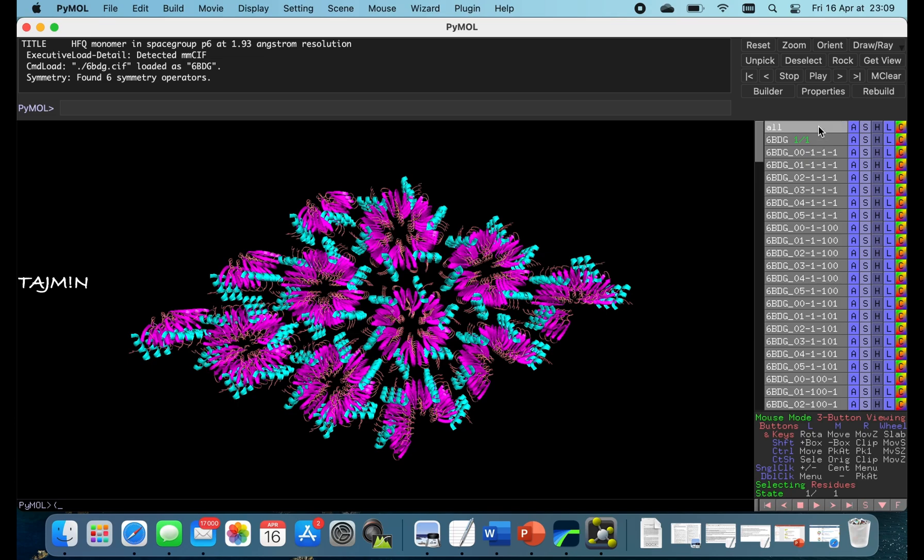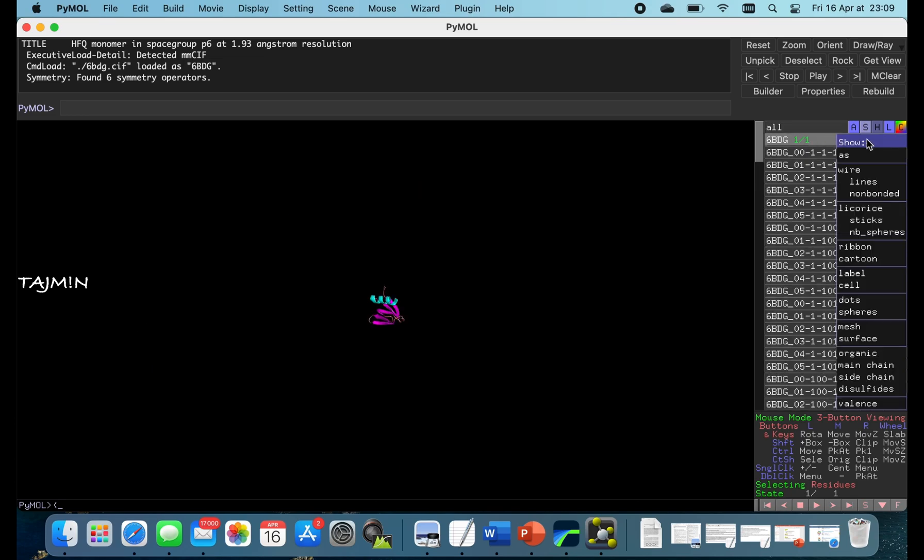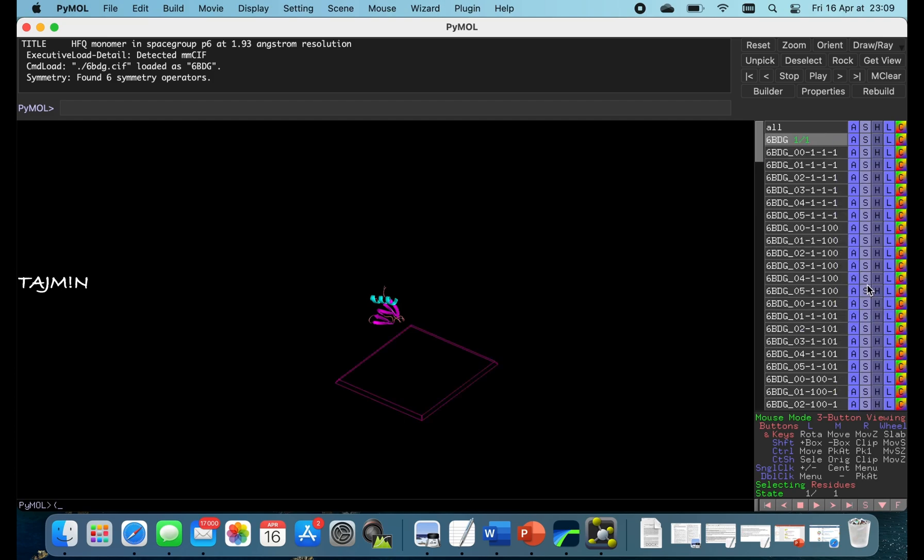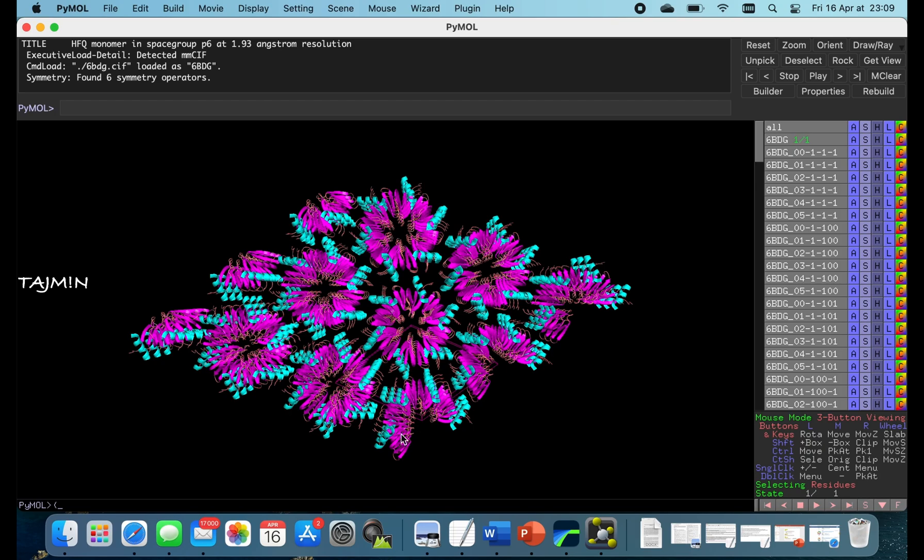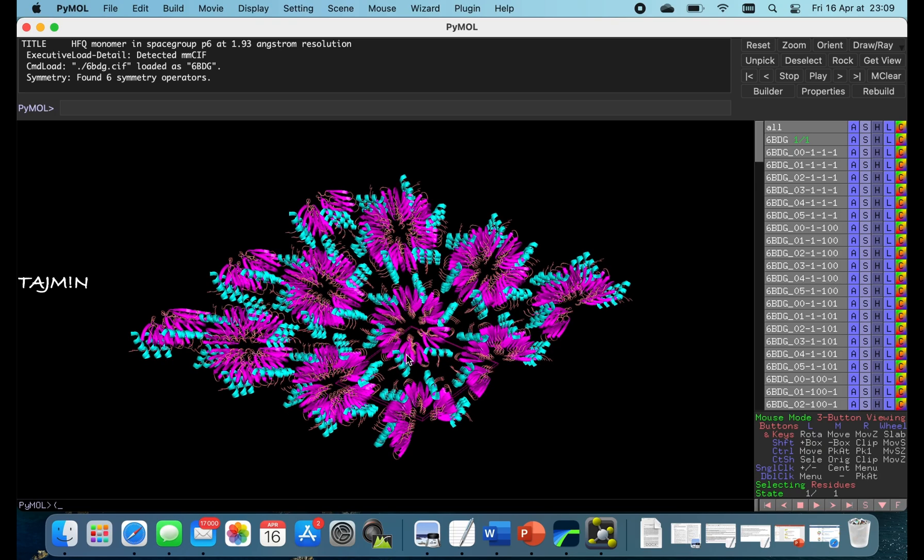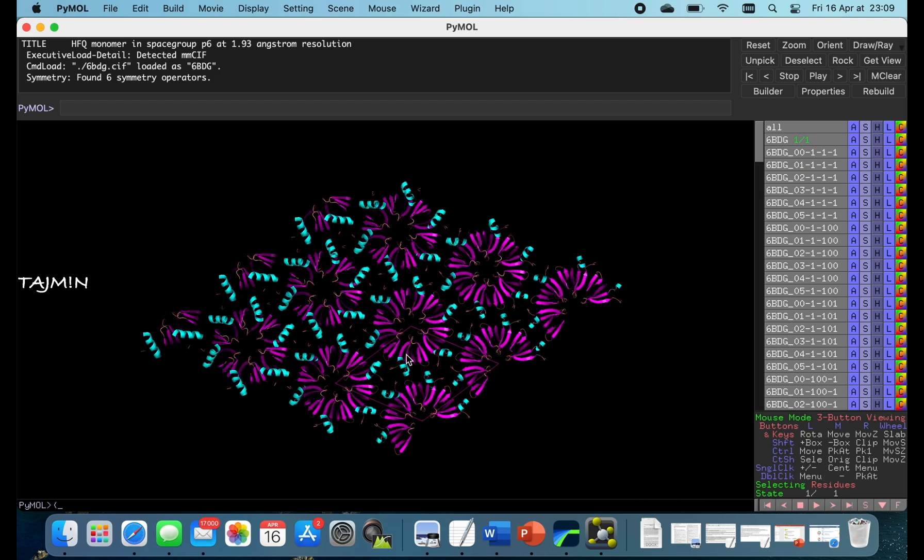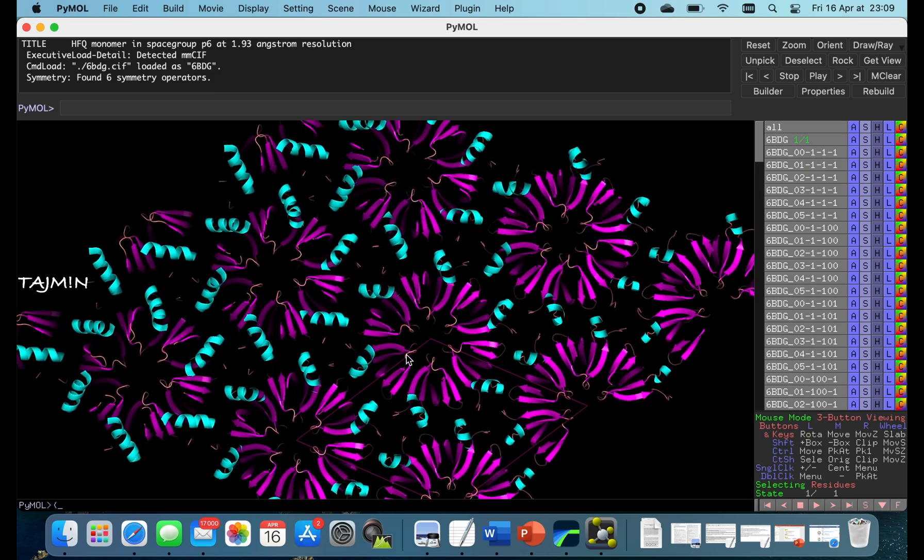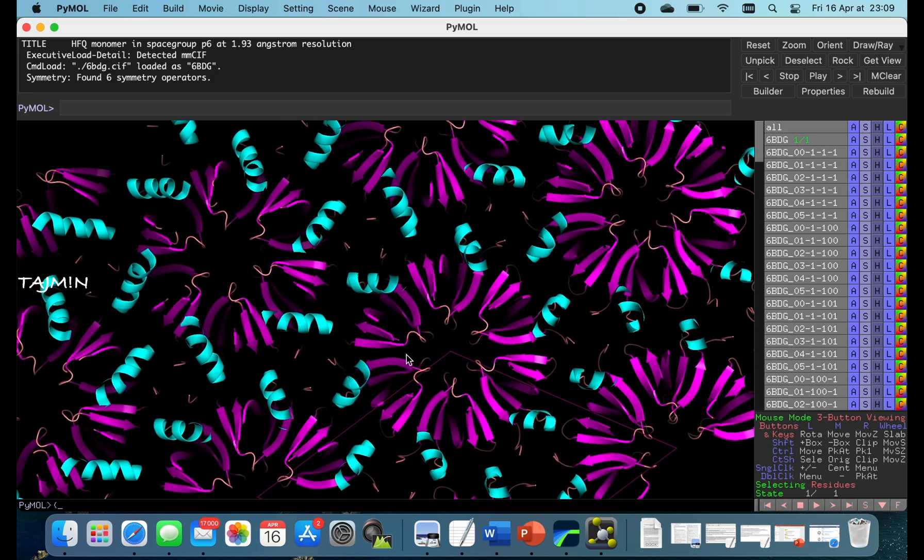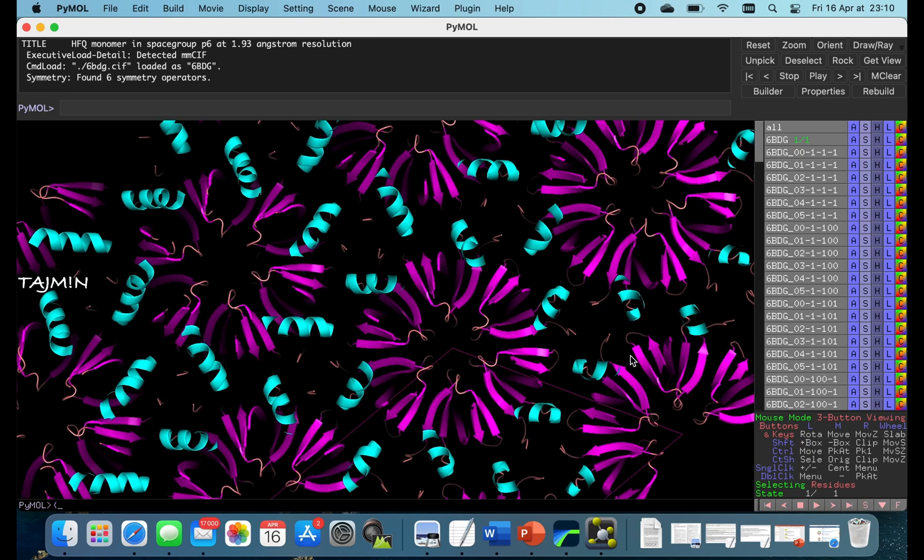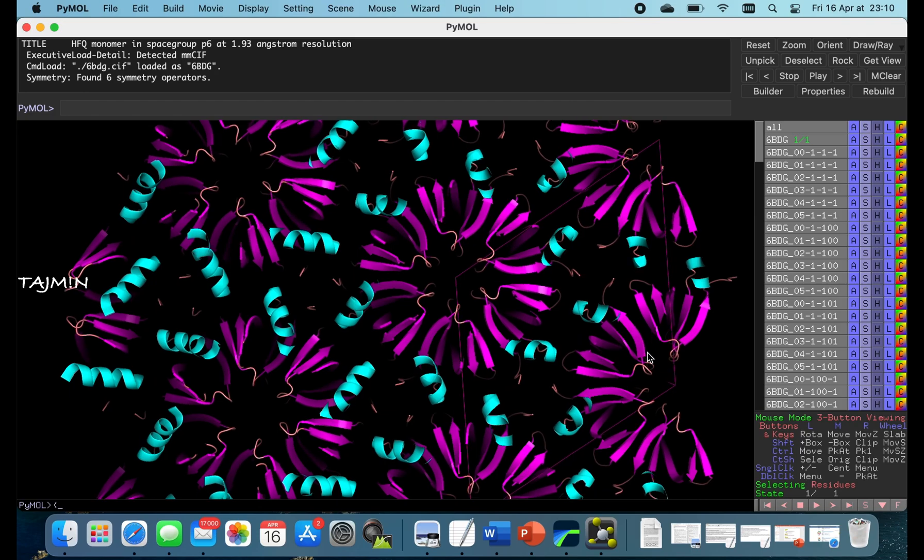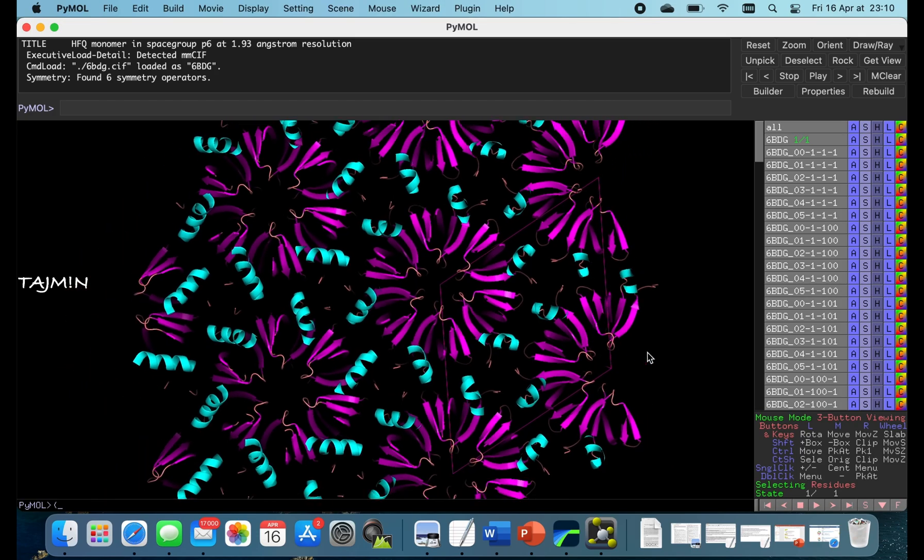Let's show the cell for a symmetry mate and then we will try to understand the crystal symmetry. You can observe here 6 alpha helices from 6 different monomers arranged in P61 symmetry. That's the beauty of crystallography. It's really amazing.